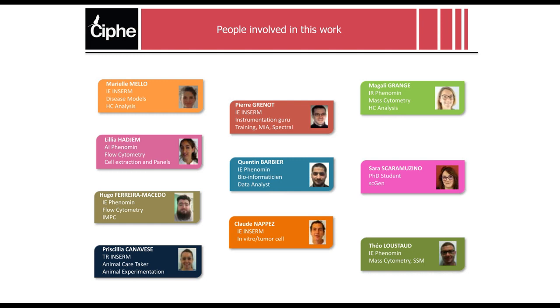And to conclude on that, I would say that nowadays we mostly use Cytobank solution to project our data analysis capabilities to our partners due to this very easy sharing capacity. Like this, we allow our partners to have access to raw datasets through the illustration interface of the Cytobank solution.